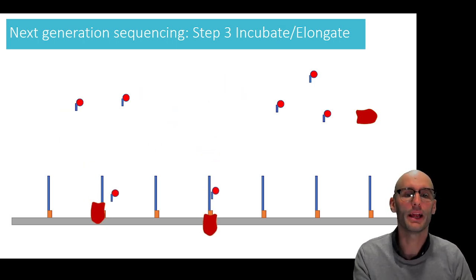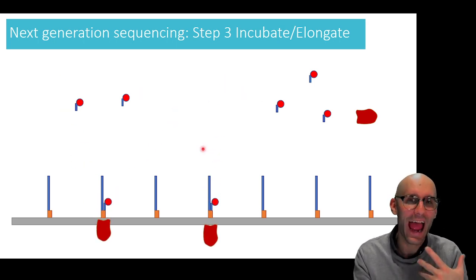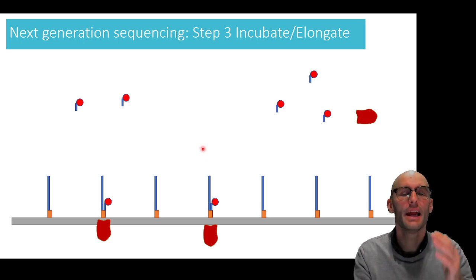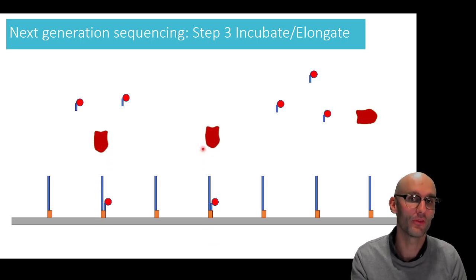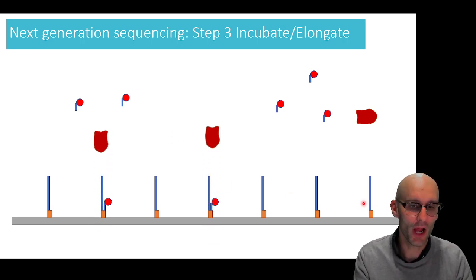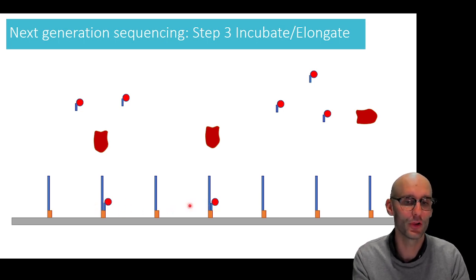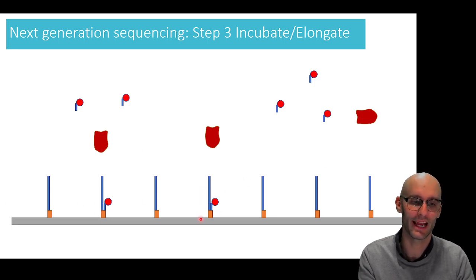So what's going to happen now is on the fragments that have an A, adenosine, available for the thymine to attach to, the thymine will now attach with the help of the DNA polymerase. So the thymines have attached to this strand and this strand because there's an adenosine right there just above the double-stranded bit of DNA. So over here, we must have different nucleotides, like a C or a G or a T. But over here, we have an A, which the thymine, we're now incubating it with thymine, can attach to. So we have successfully elongated just these two bits of DNA here, but not these bits of DNA over here.